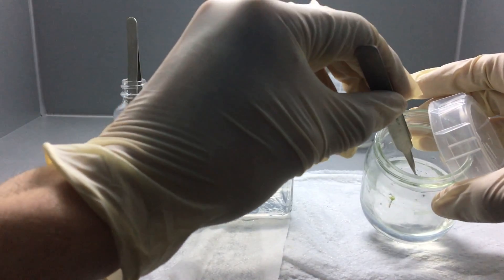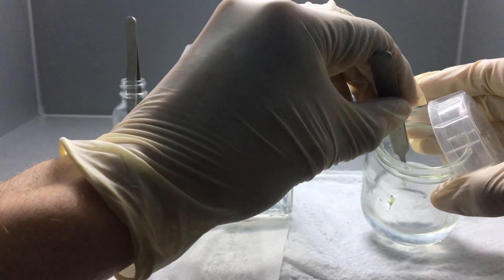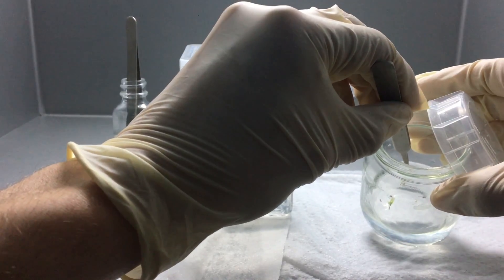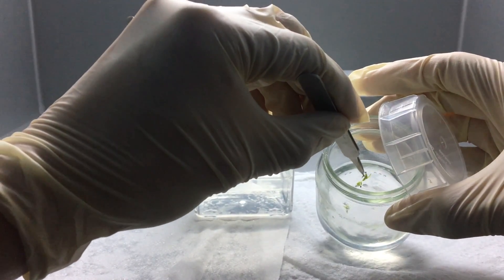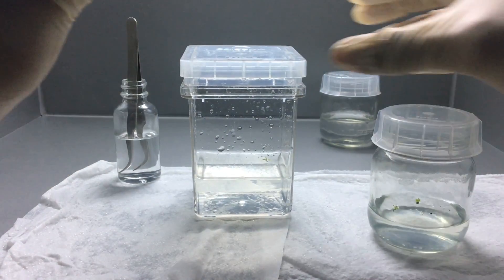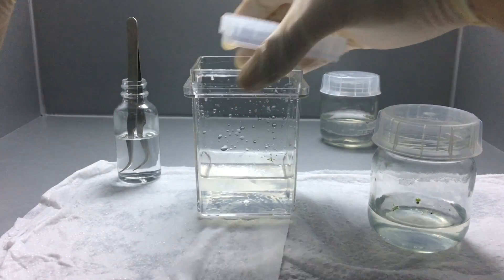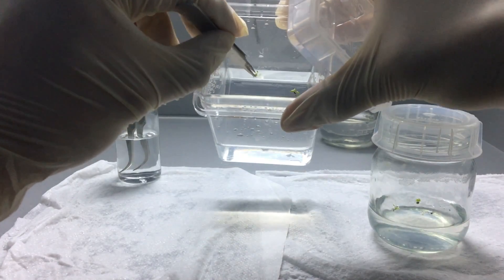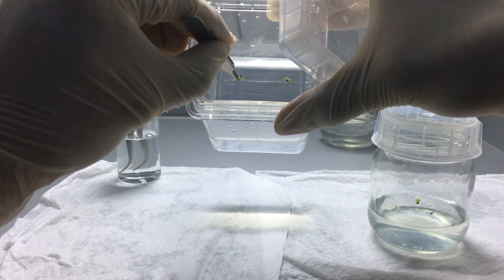I also wanted to keep the leaves above the media because I've noticed when the leaves are growing submerged, sometimes they don't grow normally. I've had my Drosophyllum leaves grow without tentacles until they come up, and then as soon as they break through the surface, they start growing perfectly fine.